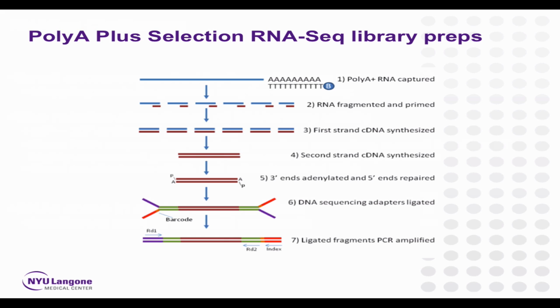One word about PCR amplification is that because you cannot avoid PCR amplification with RNA-seq, the higher the number of cycles, the higher the number of PCR duplicates, and I think you're going to cover that at some point. No, not much. In any way, PCR duplicates are basically an artifact, and you want to somehow account for them depending on the modality of sequencing, but just to bear in mind that it's highly dependent on the number of PCR cycles.